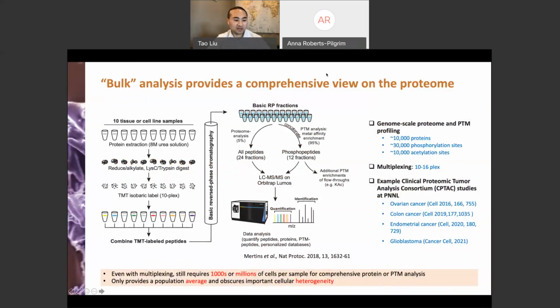All right. So mass spectrometry-based large-scale proteomics using multidimensional separation is becoming a mainstream workflow for a lot of deep-level characterization of protein expression and PTM. I'm highlighting one such workflow using isobaric labeling. By doing this, you can have higher throughput and really deep coverage. We have been using this for many of our milestone works for several tumor types, and not only in our lab but also across CPTAC and other centers as well.